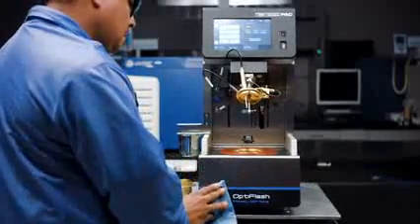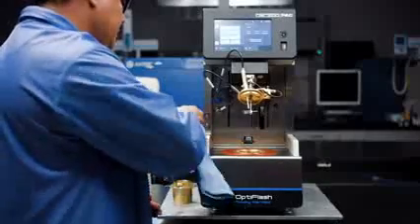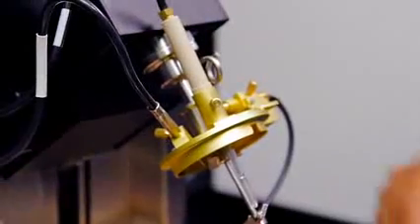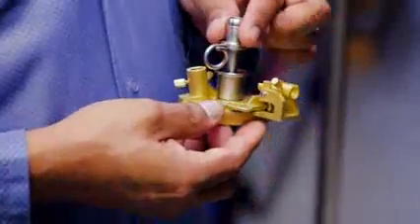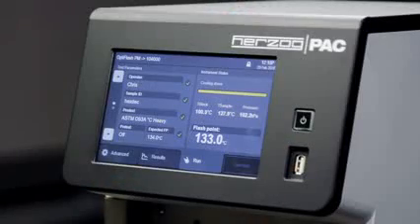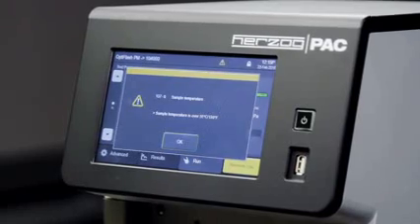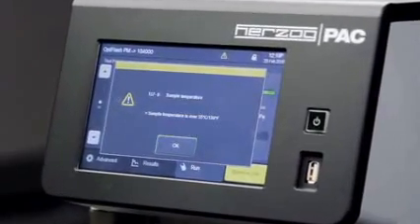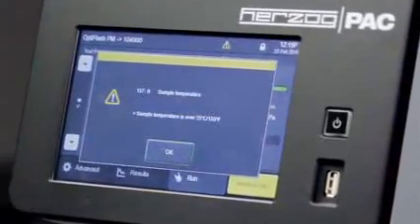OptiFlash is also much easier to clean due to an innovative design, which allows for the disassembling of the cup cover with one simple button push and the removal of the shutter without any tools. A special procedure for high viscous samples keeps them at a standby temperature at the end of the test, which makes it easy to clean even the most difficult sample types, such as bitumen.